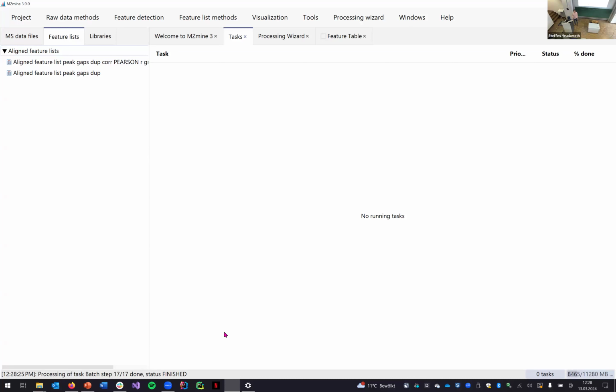If you really want to compare software and compare results and compare optimization, I think that's a whole PhD thesis or a whole project in itself. What I think should be done for comparing these tools is someone should come up with a data set, come up with a ground truth of the data set, which is in itself super, super hard. And then give it to the developers of the individual tool. So you really have the experts of that tool optimizing the tool. And then you compare the results, not the experts of one tool comparing the results, but you know the ground truth and you compare what the individual softwares came up with. But I think that's, I don't know, 3 years of work or so to properly do that.